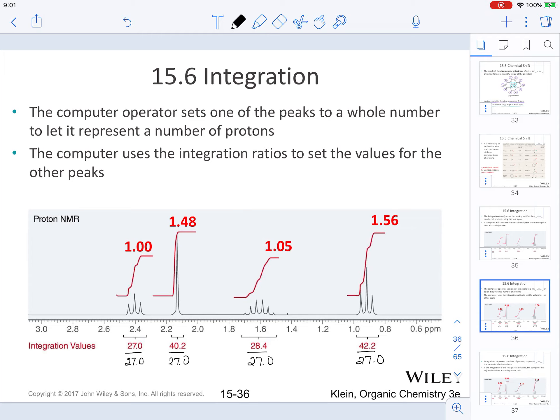The result from that division gives rise to the values we see on top of the step curves. Looking at the values from downfield towards upfield, the first signal has an integration of 1, the second has 1.8, the next has 1.8, and the last one has an integration of 1.56.